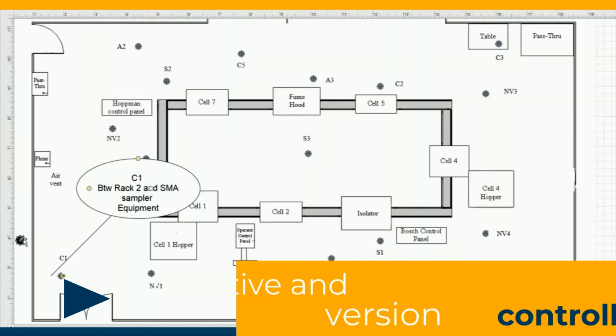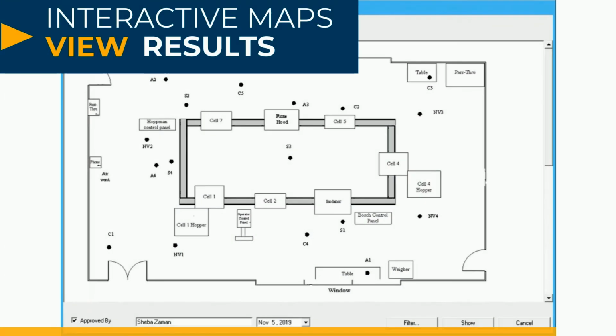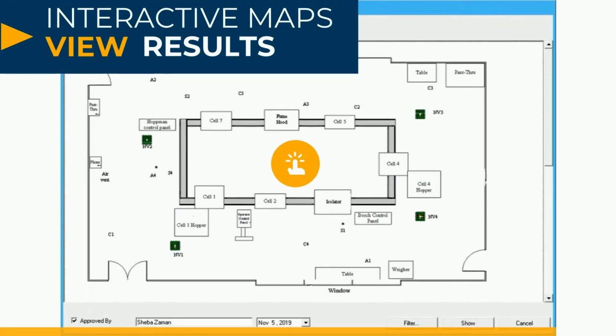Upload interactive and version-controlled maps directly into the system with all of your sampling points. With the click of a button, view all of your results on an interactive map.